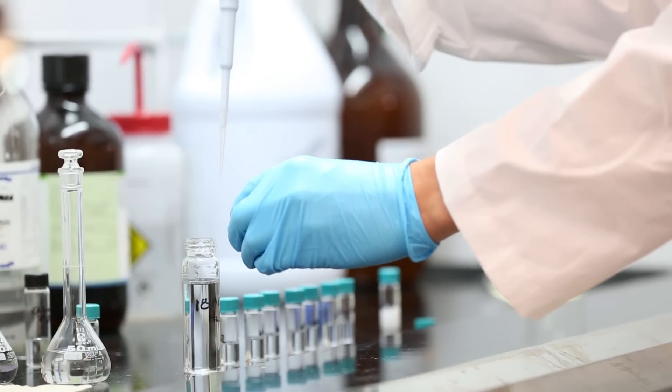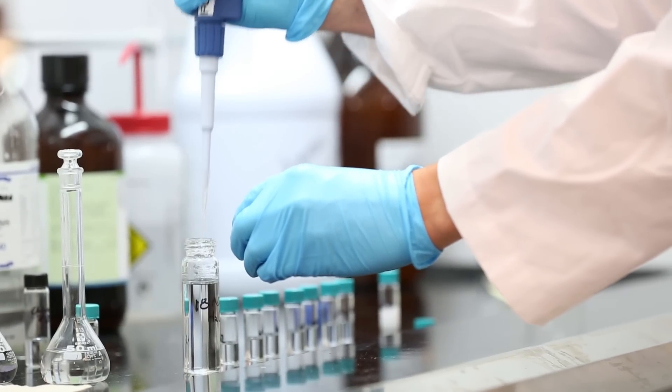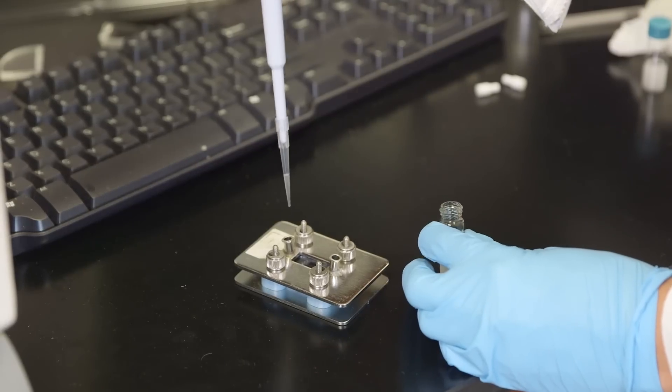Every day when I come into lab, I synthesize reverse micelle particles, which is a water core surrounded by an organic surfactant.